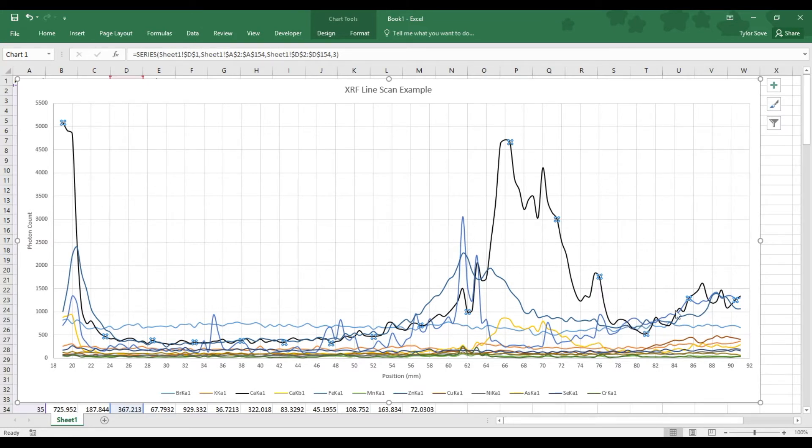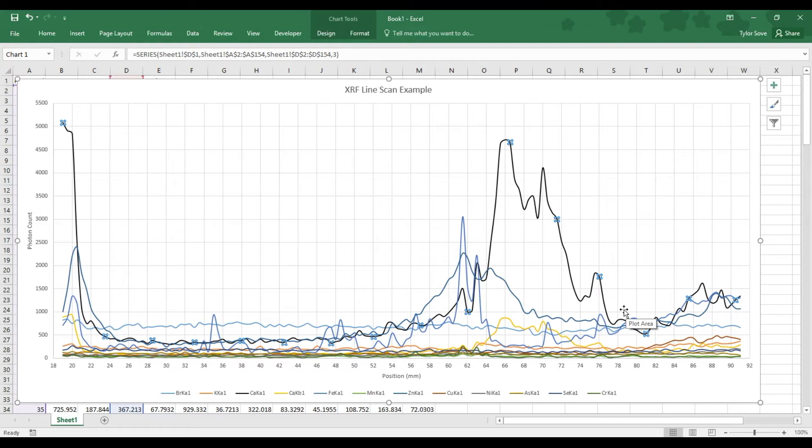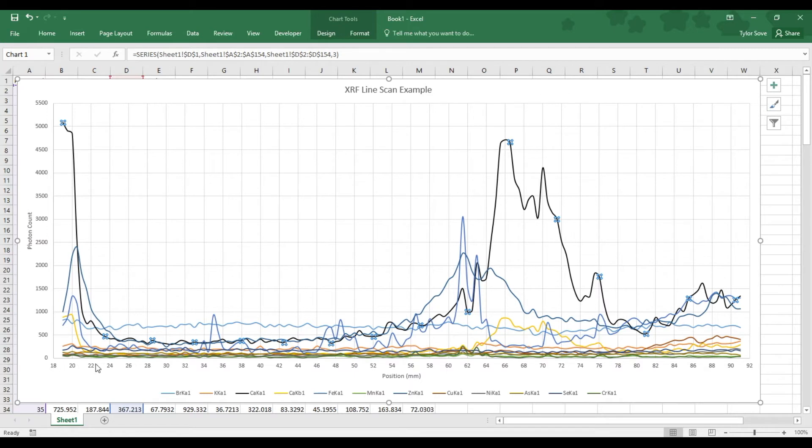Following that, the concentration again oscillates around and kind of plateaus. That's how you'll interpret and understand this graph—just in the relative height changes that the different elements have. That will tell you the relative concentration changes throughout the position of the sample.